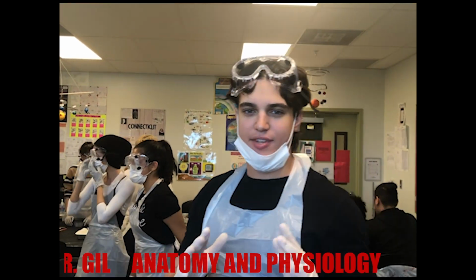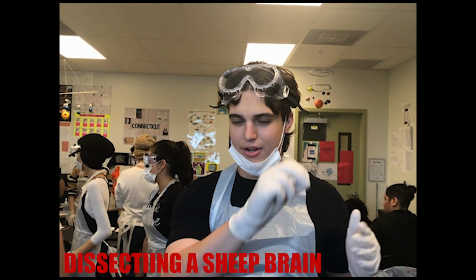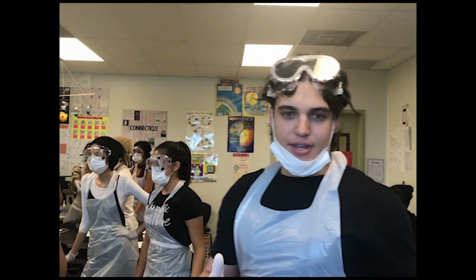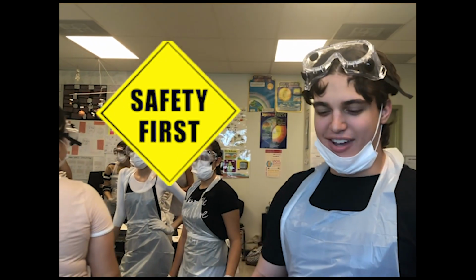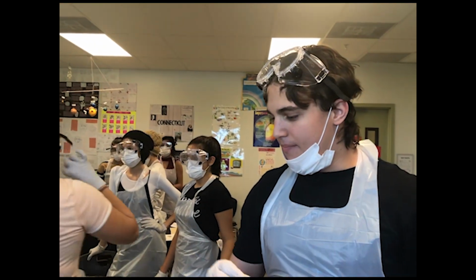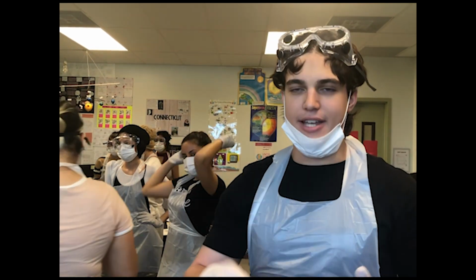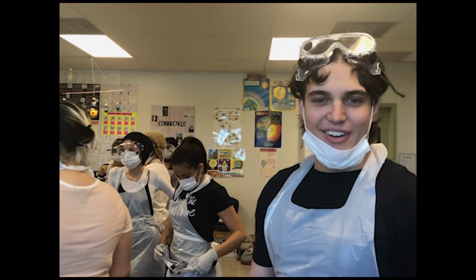Today we're going to be dissecting a sheep brain. Gils' class is learning right now about the nervous system and the parts of it. So right now we have our students here, all set with their gear and everything. Safety first, remember. We are going to be opening up the structure and detailing it, and we're going to be taking notes and all that. We're learning about the nervous system, so this should be good.